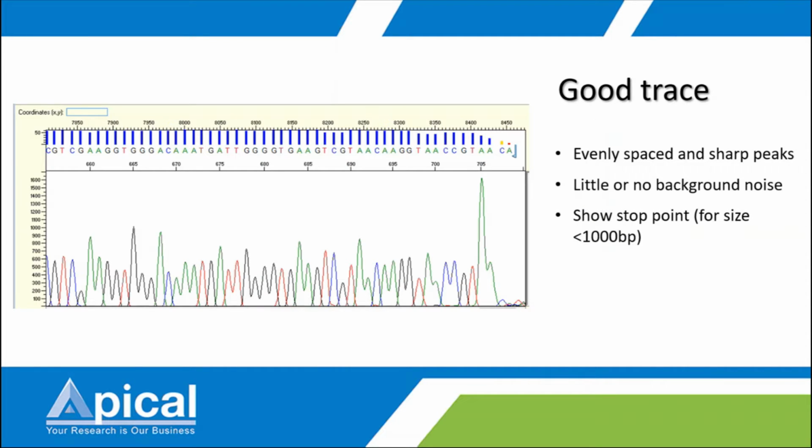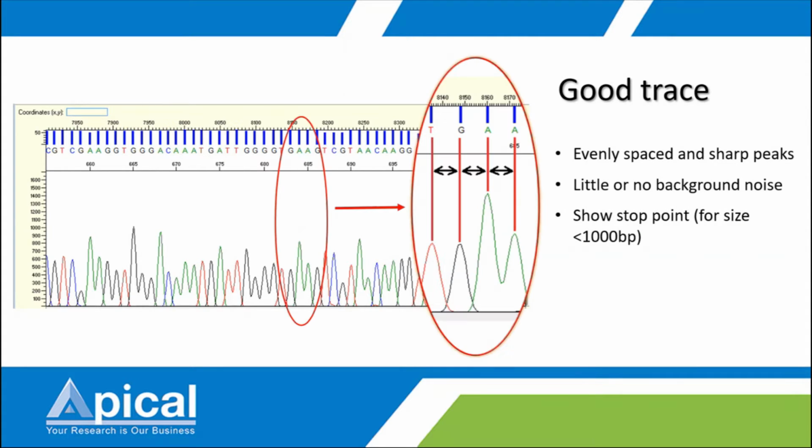So what is a good result? A good result should have clean spacing between the peaks, they should be even, and it will show sharp peaks.